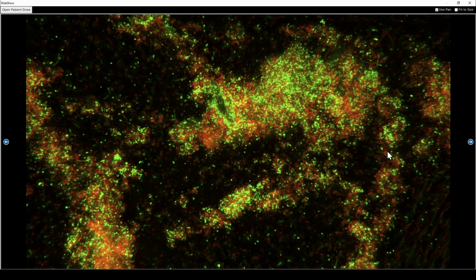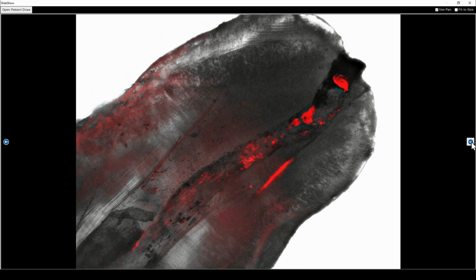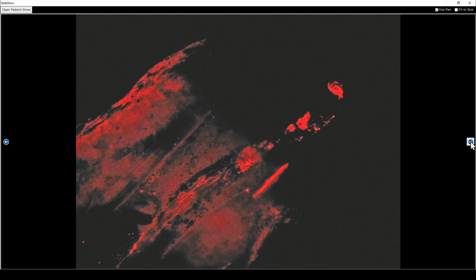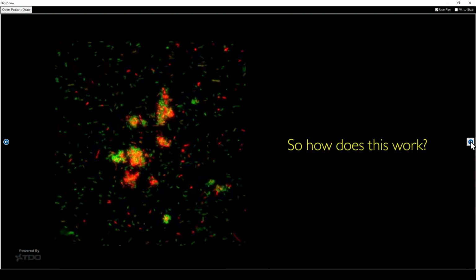So it's another perspective that adds a lot to biofilm science. This is wheat germ agglutinin that probes carbohydrate in the biofilm matrix. So now I know there's biofilm wherever the confocal lights up the wheat germ agglutinin. It gives you another powerful tool besides electron microscopy.